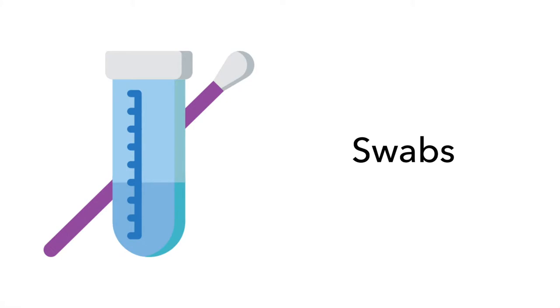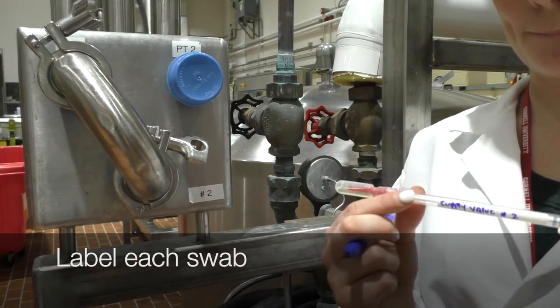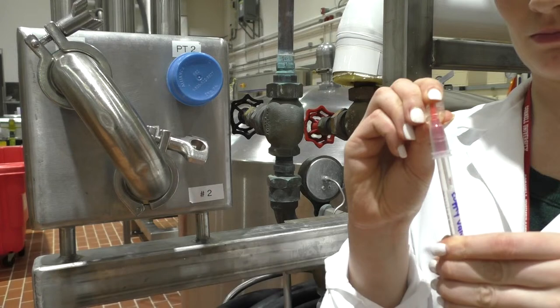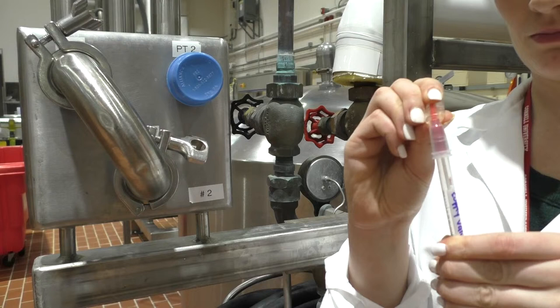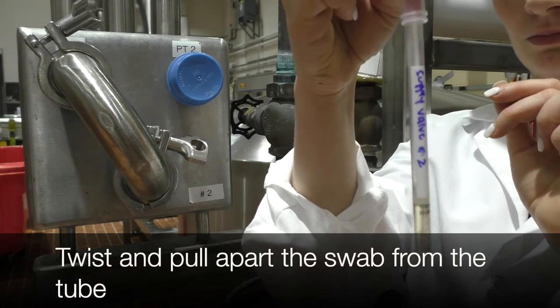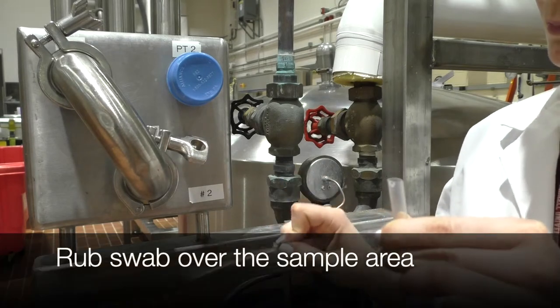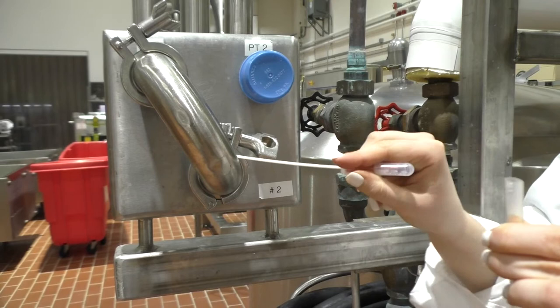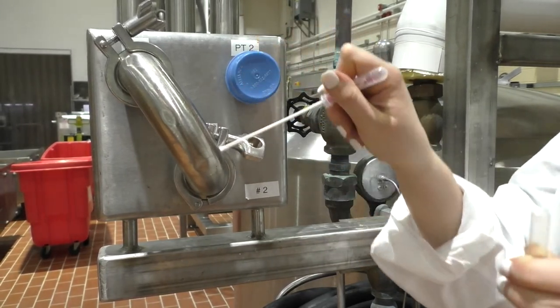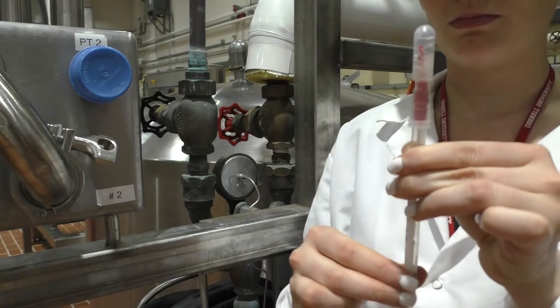Now we will cover swabs. Swabs may be more convenient for harder to reach areas. Label each swab using a permanent marker. Bend the red snap valve at a 45 degree angle until you hear the valve break. This allows the lethene broth to fill into the tube end and wet the swab bulb. Squeeze the bulb of the swab to transfer all the lethene broth to the tube end. Twist and pull apart the bulb end from the tube end that contains the lethene broth. Rub the swab slowly and thoroughly over the desired surface area, rubbing three times and reversing directions between alternating strokes. Use firm pressure — the swab stick should bend slightly when you are doing it correctly. After sampling is complete, securely insert the swab back into the tube and transport to the lab for testing.